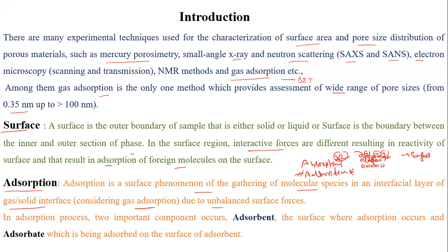And why does adsorption take place? Due to the unbalanced surface force. So these terms you have to keep in mind.